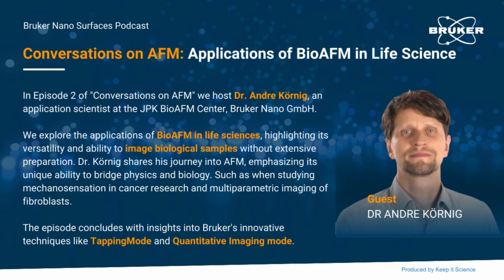Yeah. There's tapping mode and there's PeakForce Tapping mode. I'll go a bit into both of them. Tapping mode is doing an oscillation in resonance, and we use this a lot for the fast imaging I mentioned before. Images get quicker, which is becoming important in all industries. In life science, you want to see molecule interactions at a very high level of speed. And in materials, for silicon wafer people, the quicker you can measure, the quicker you get your results as well.